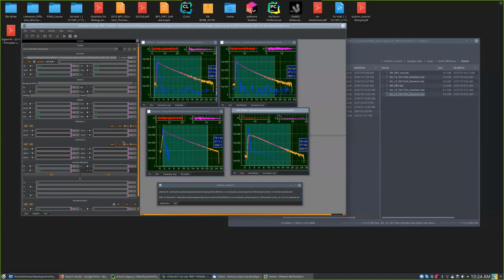Okay. So again, what kind of value do you need? I mean, the excitation. So like the emission, how much emission crosstalk? We need the excitation. You need all the crosstalk. So like the excitation probability of the donor, the excitation probability of the acceptor by the donor laser, the emission probability of the donor in the acceptor channel, and the emission probability of the acceptor in the acceptor channel. Okay. I think I cannot calculate that fast now.